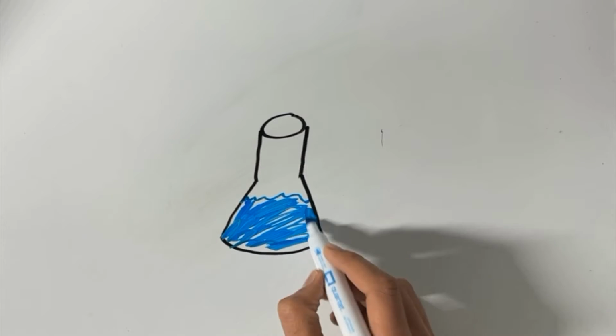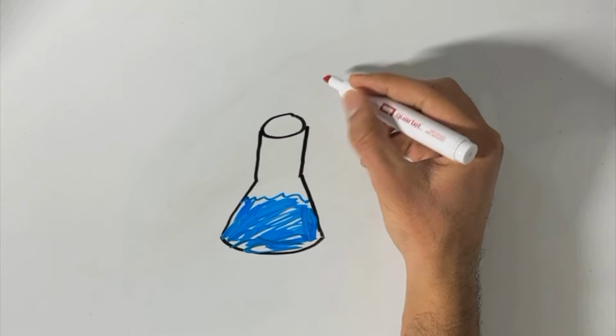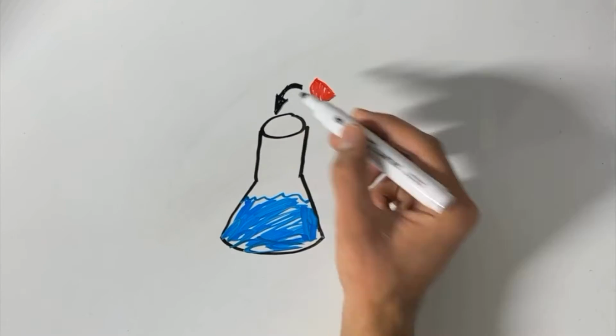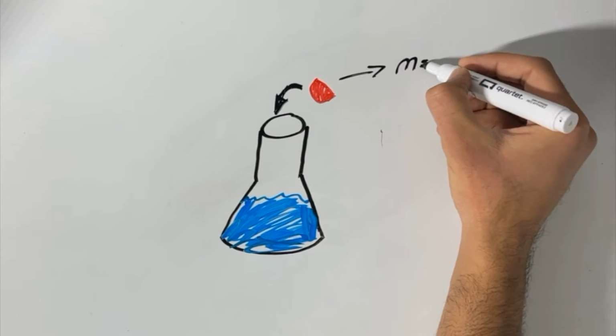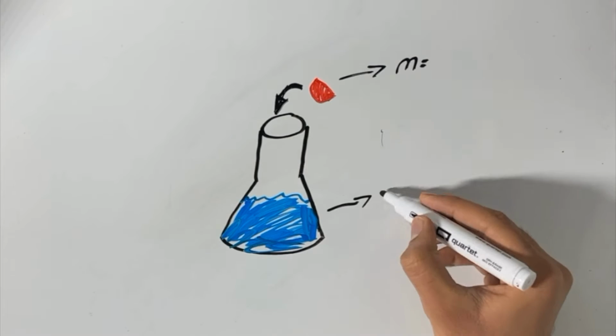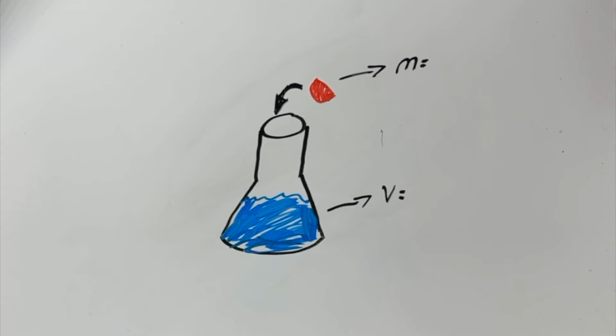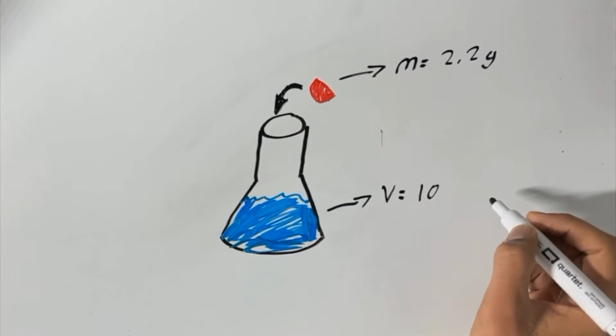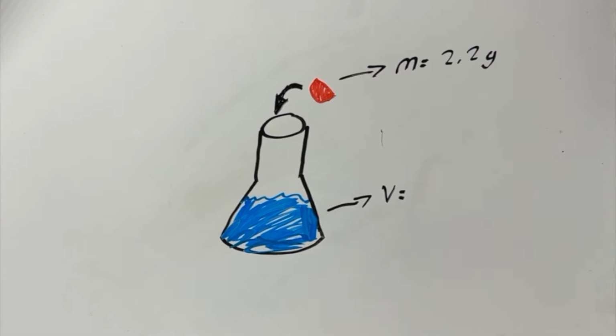The procedures for our experiments are the steps below. Step 1. Make sure all the reactants, glassware, and measurement tools are in reach and ready to use, such as the Erlenmeyer flask, water, electronic balance, vitamin C tablets, and volume measurement apparatus. Step 2. Locate the 250 ml Erlenmeyer flask, and in the flask add roughly half a cup of water.